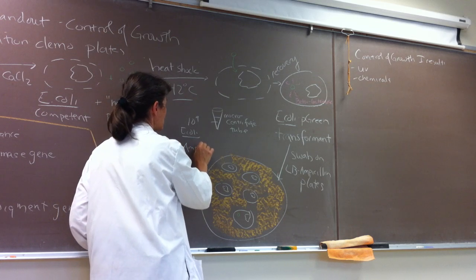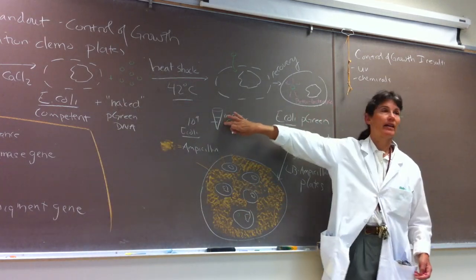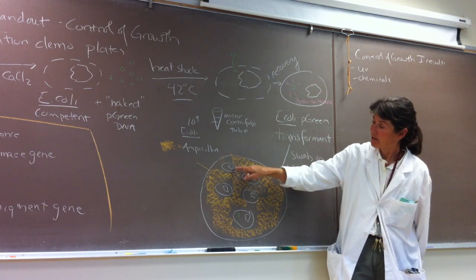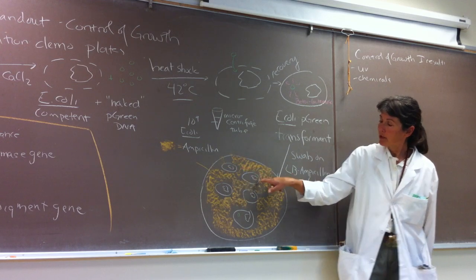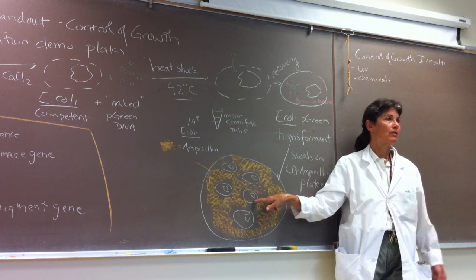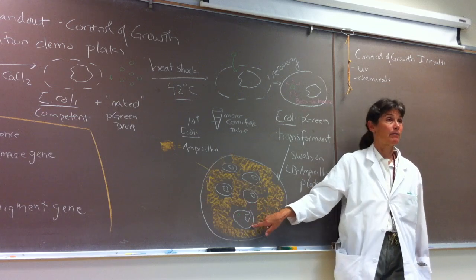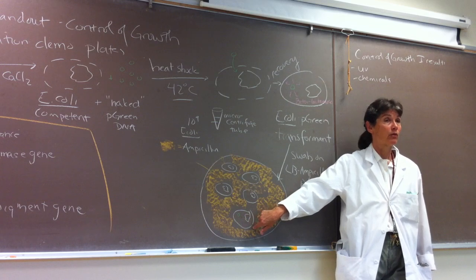Okay, and what I cartooned here is just a few of the E. coli from that initial transformation mix. And again, you guys, these aren't colonies. These are like huge, giant E. coli cells, so they represent cell wall, cytoplasmic membrane. This squiggle is a chromosome. And what we want to note here is that most of the E. coli were not transformed, right? It was a relatively rare event. So in this cartoon, 4 of the E. coli were not transformed. Only one of them down here has a little pGreen plasmid. We only have one transformant here.